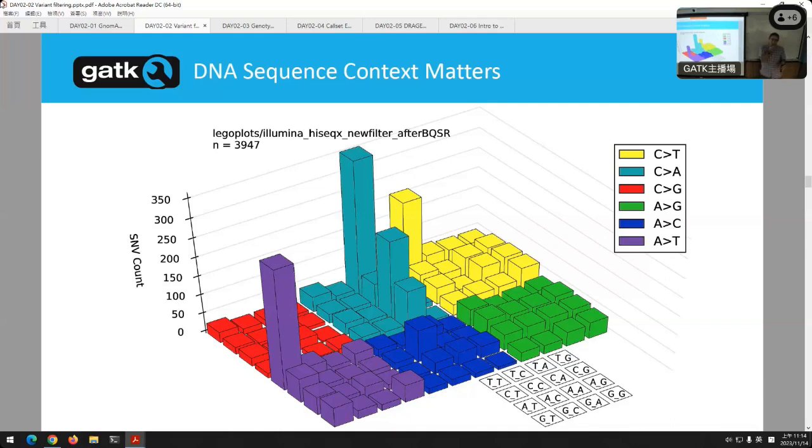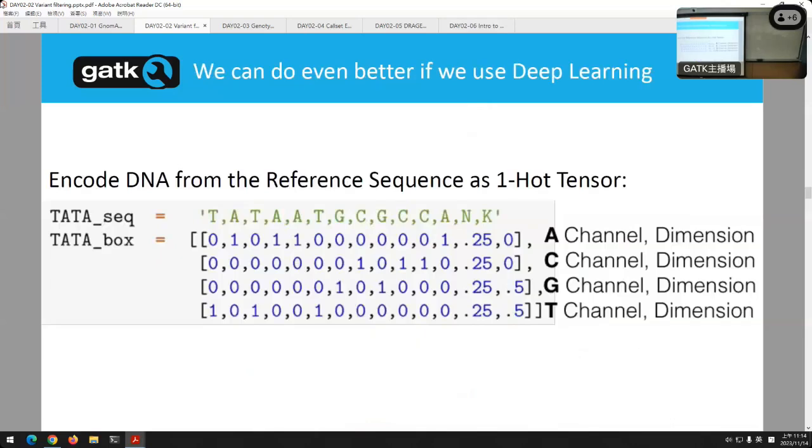That's very useful. We didn't use that in VQSR. We should be able to use that. Okay? Does that make sense? I don't need you to understand that entire plot, but just the concept there. All right. The next few slides, I just want to get my laptop. The next few slides will be a little complicated. I don't want you to go into, just like I didn't want to scare you with the math of the HaplotypeCaller.